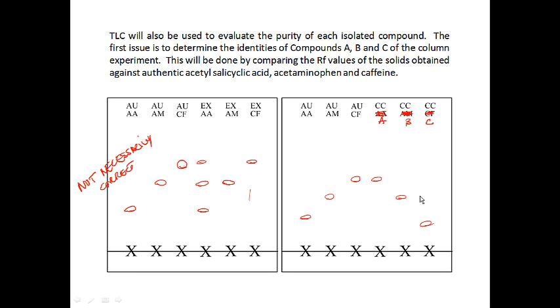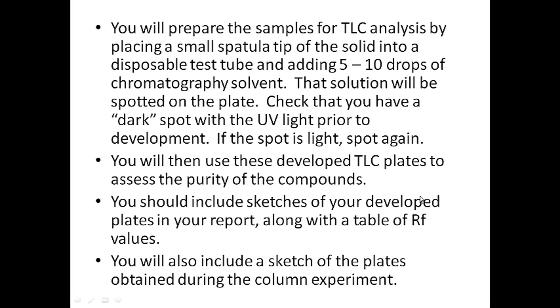So that's what you're going to do in week 3. Measure melting points, measure masses, do the TLC plates, and then develop the TLC plates. And you'll do these TLC plates individually, even for the group experiment. So you're going to use the TLC plates to assess the purity, and you should sketch out those TLC plates in your report and in your notebook, or I suppose you can take pictures of them.